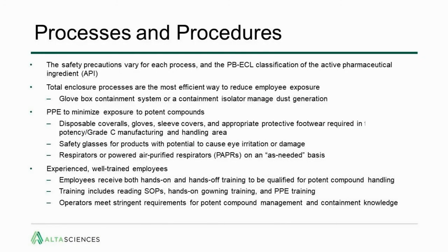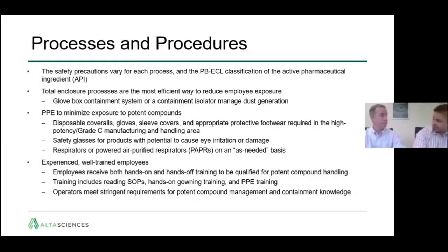So that's a really good point about disposables, Sean. I know a few products we've actually taken it essentially one step further, where the outside firm may have said we needed to, or we just thought, you know what, let's add one more level of protection for the employees in a manner of a PAPR, a powered air purifying respirator. So essentially it's an additional bunny suit over the entire employee with positive air pressure over their mask, over their face. Obviously that's filtered.